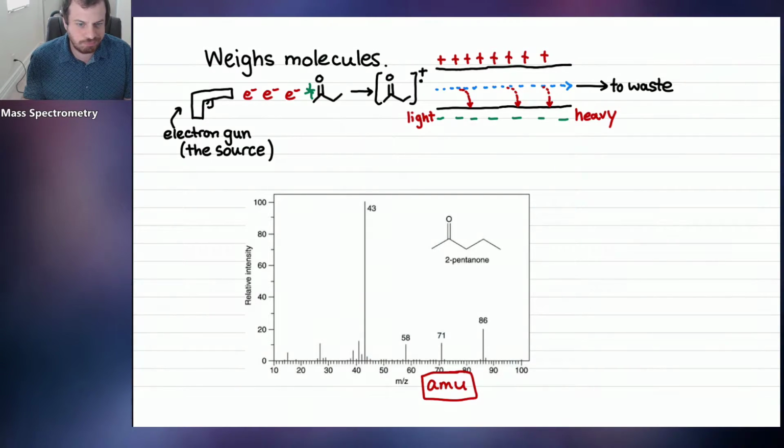And so, that's interesting. It seems that there are multiple peaks in our mass spectrum of this compound. Why are there multiple peaks? You might think, oh, maybe there are impurities in our compound, and that's what each peak is referring to, an impurity, but you would be incorrect. Let's take a close look at what this graph represents.